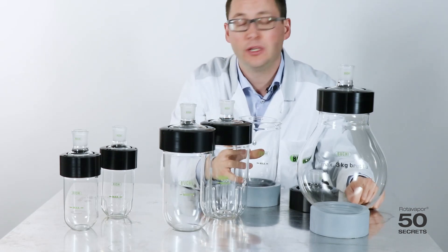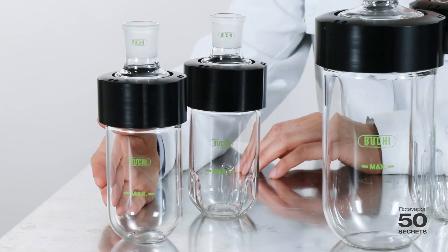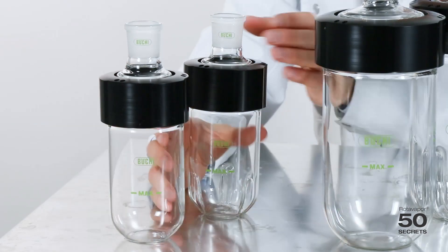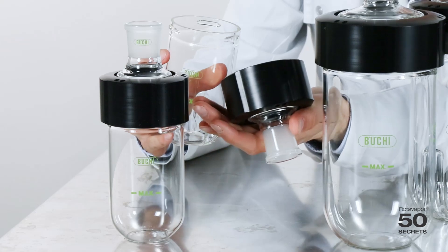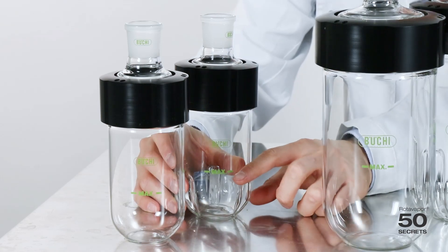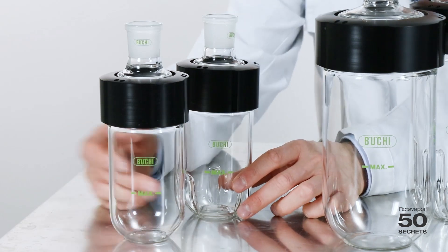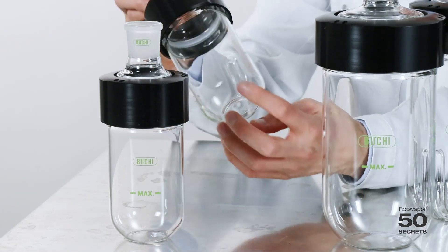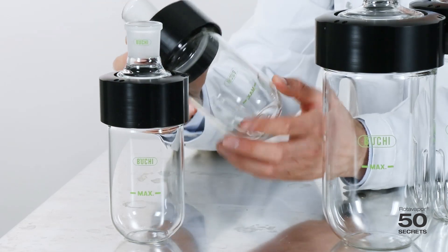I would like to talk about the individual beaker flasks now. The first one is the 0.5 liter beaker flask — it's a very nice, little one, easy to handle. Opening and closing is exactly the same as shown before. It can be filled up to the maximum level, and we have it in two different variants: one without and one with notches. The notches are used for drying, so the powder or whatever is in the flask will jump over these notches and should not stick to the wall as much.